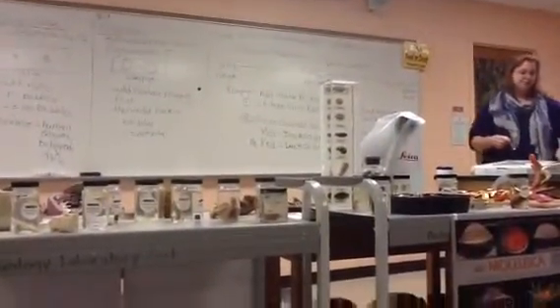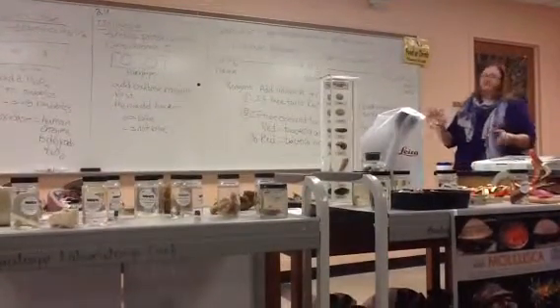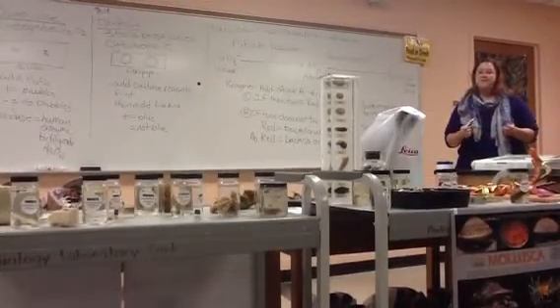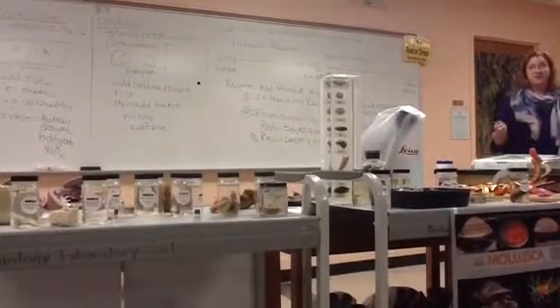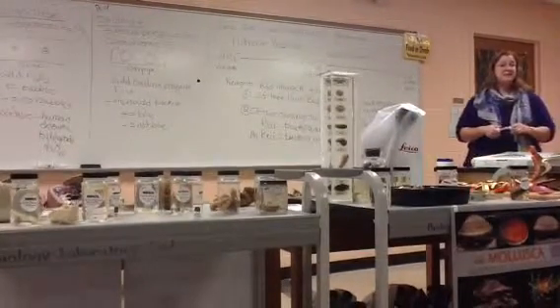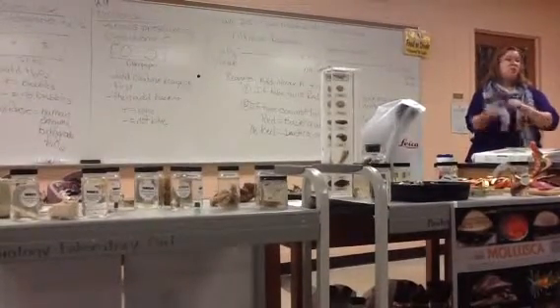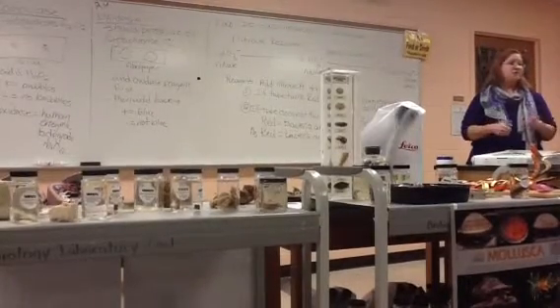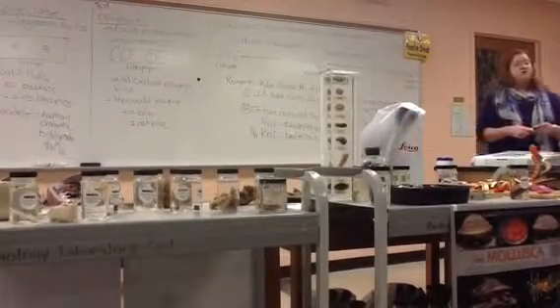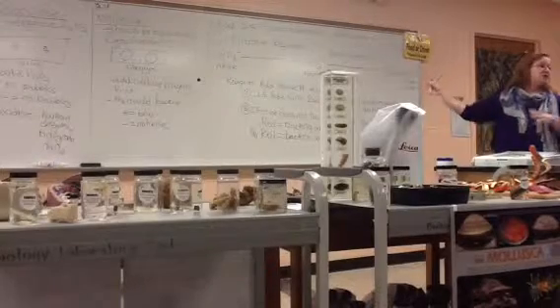The name of the lab for lab 25 is nitrate respiration. We're actually going to be looking at 2 separate but related processes. This is part of the nitrogen cycle. Most of the nitrogen on the planet's surface, at least, is nitrogen gas. Most of our atmosphere is nitrogen gas. We've got more nitrogen than we do oxygen in what we breathe in. But we can't use nitrogen directly from its gas form. Neither can most bacteria. So there's a whole cycle for getting that gas form of nitrogen into usable forms, and this is part of that process.